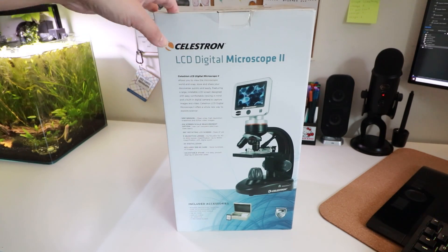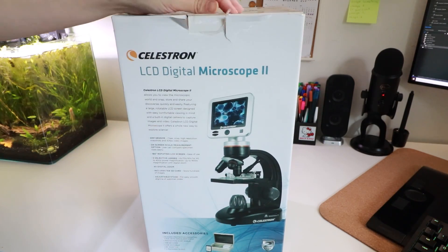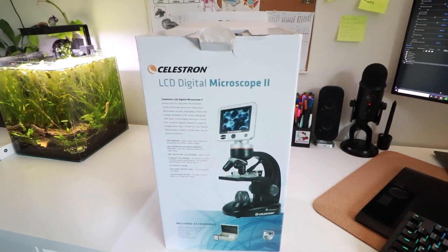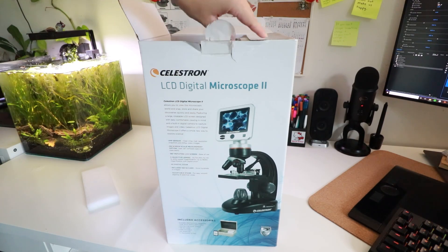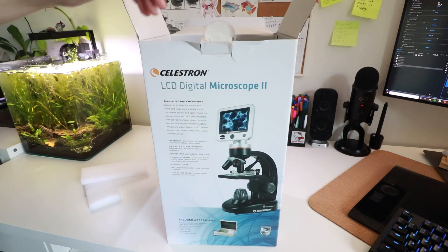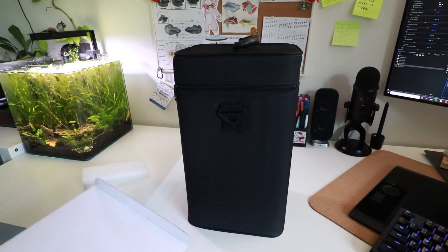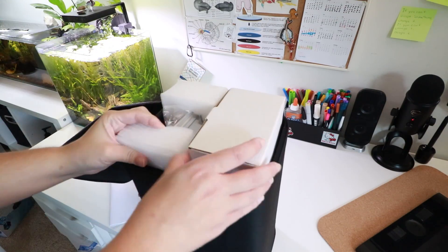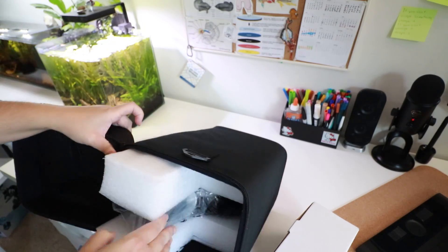Here is the microscope that I ended up getting. This was per Dr. Eric Johnson's recommendation because he wanted me to get something simple to use that will very easily capture videos as well as photos, and will not be too pricey. So this is definitely a good budget microscope that, if you're a beginner just starting out and you don't want to spend a lot of money, I think will be really great. If you're more serious and want something fancier, go right ahead. But let's take a look at this microscope and all the doohickeys that come with it.